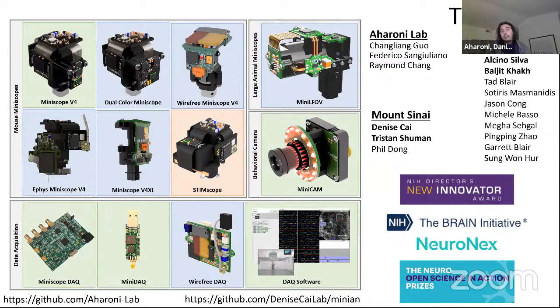So with LabMaker and Open Ephys, they have to be interested in actually bulk ordering and supporting these tools and assembling them or putting together kits. But they handle all of that. Our only role is, if we're making new modifications, we make sure they know. If they get feedback about issues in the design, they feed that back to us. We want to make sure these are reliable for people that get these systems from anyone. We hope that they're reliable, and we want to make sure they're affordable.